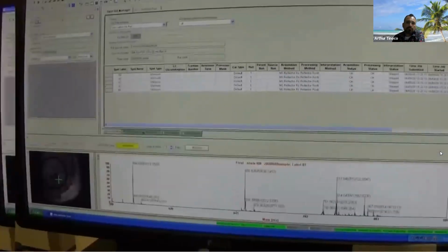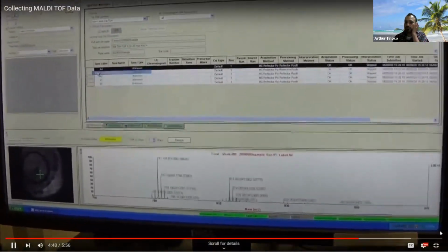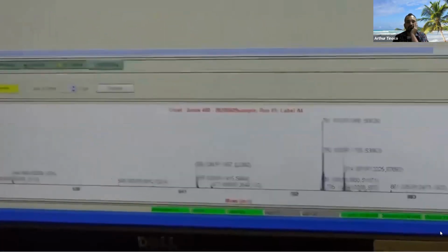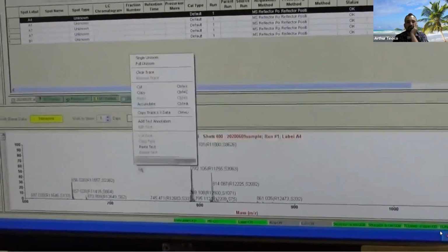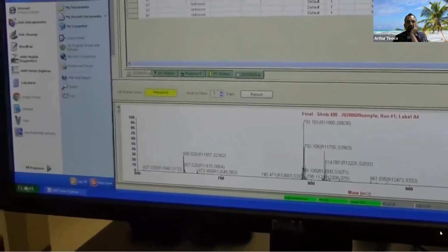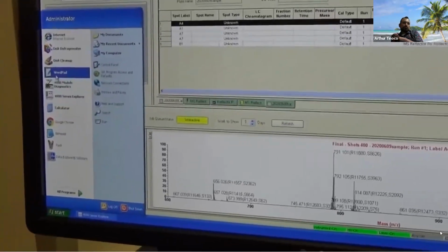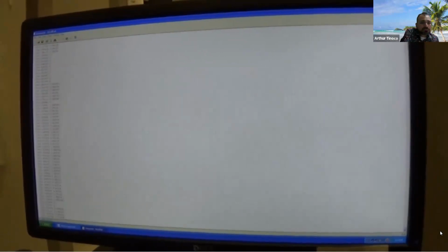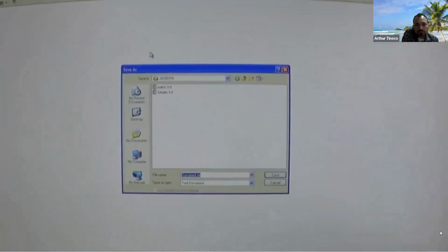Click on the plate icon. We will now convert the data set to be able to analyze it in a plotting software. You right-click on the file name and you click on the actual data set. I'm zooming in on the data set into the region of interest. And then I right-click and click on the copy XY data. I then open up WordPad and insert the data that I copied here. Then I save this data set into my folder.